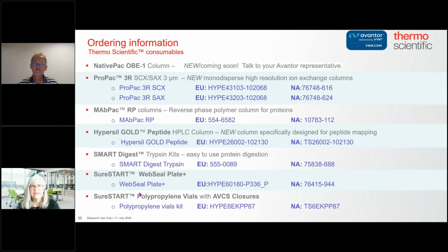Okay, thanks a lot. The next question is coming from Switzerland. Can you really detect the difference between a deamidated and non-deamidated protein with a mass difference of only 1 Dalton? Yeah, it's always better if you can separate the peptides out. That's why we're looking at that new peptide column. We didn't just look at it because it'll retain some hydrophilic peptides, and it'll give you a peptide map, since any C18 column will give you a peptide map. The one we've got there separates the deamidation variants, and it's the selectivity difference that does that. It's got a good selectivity.